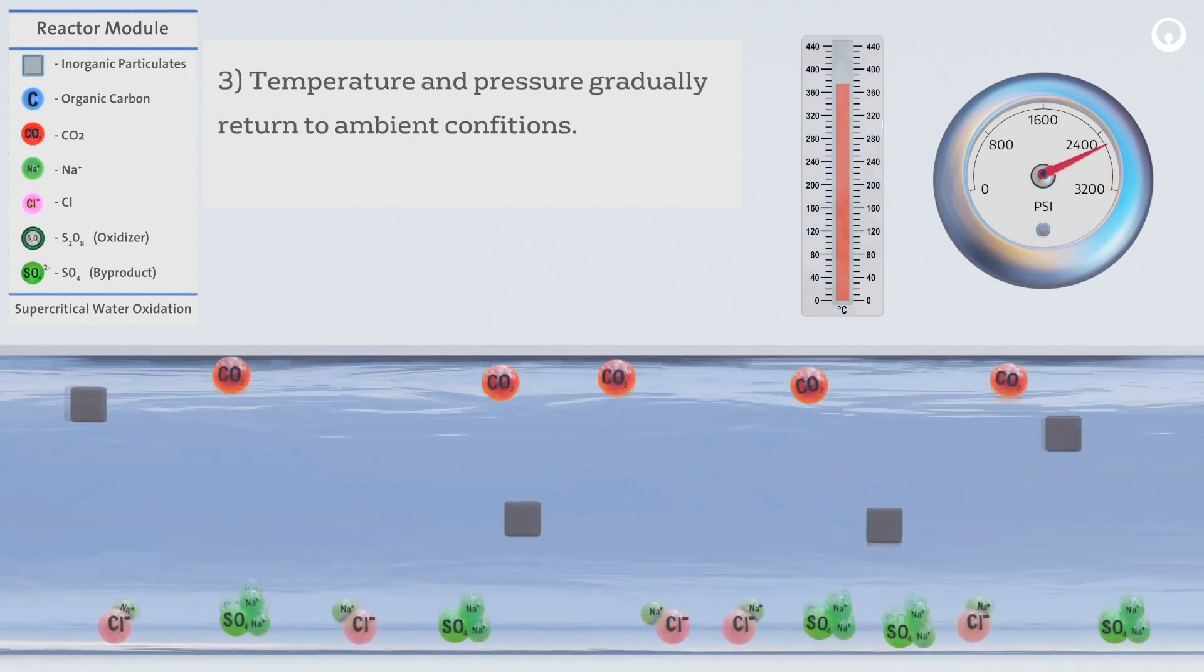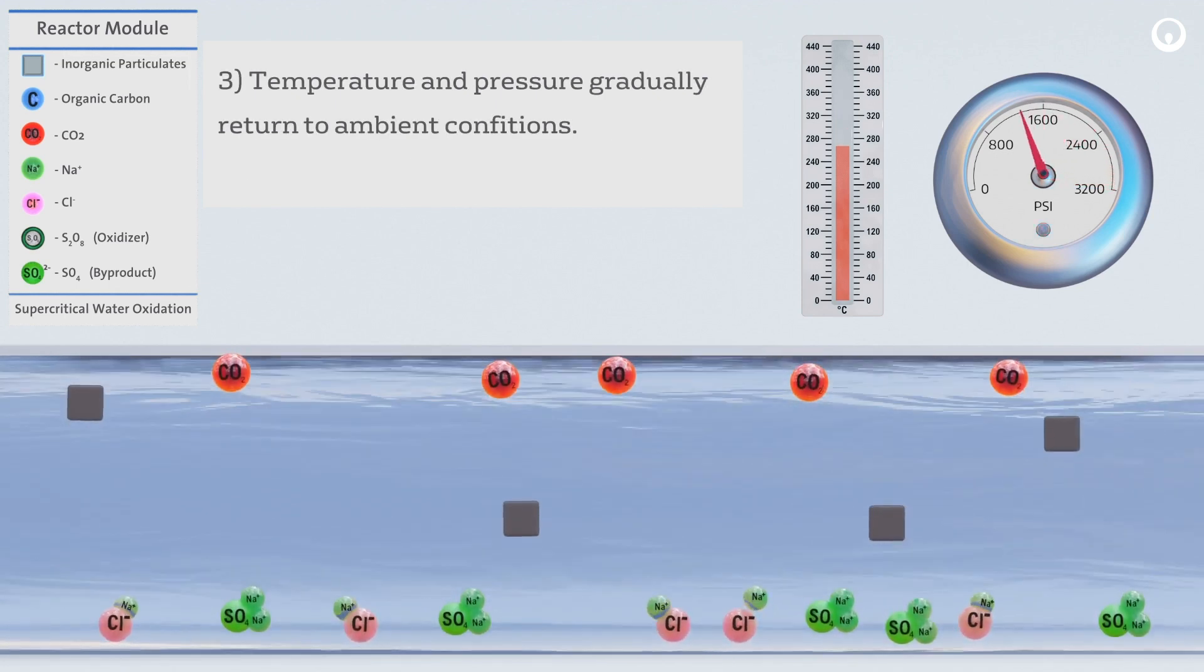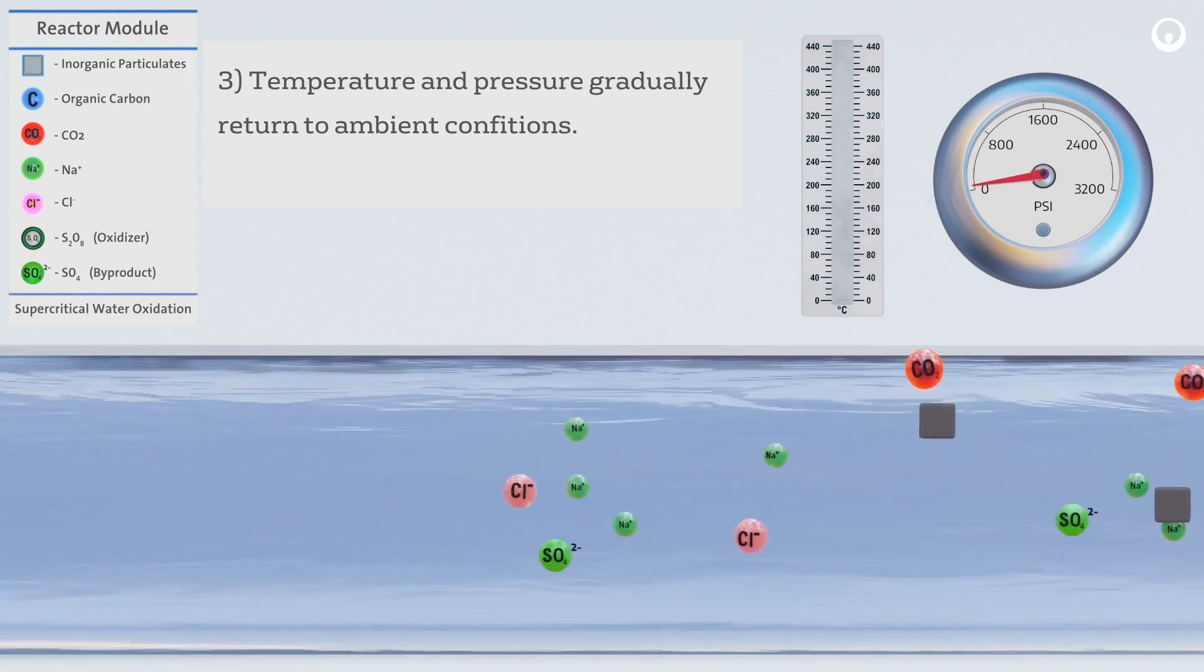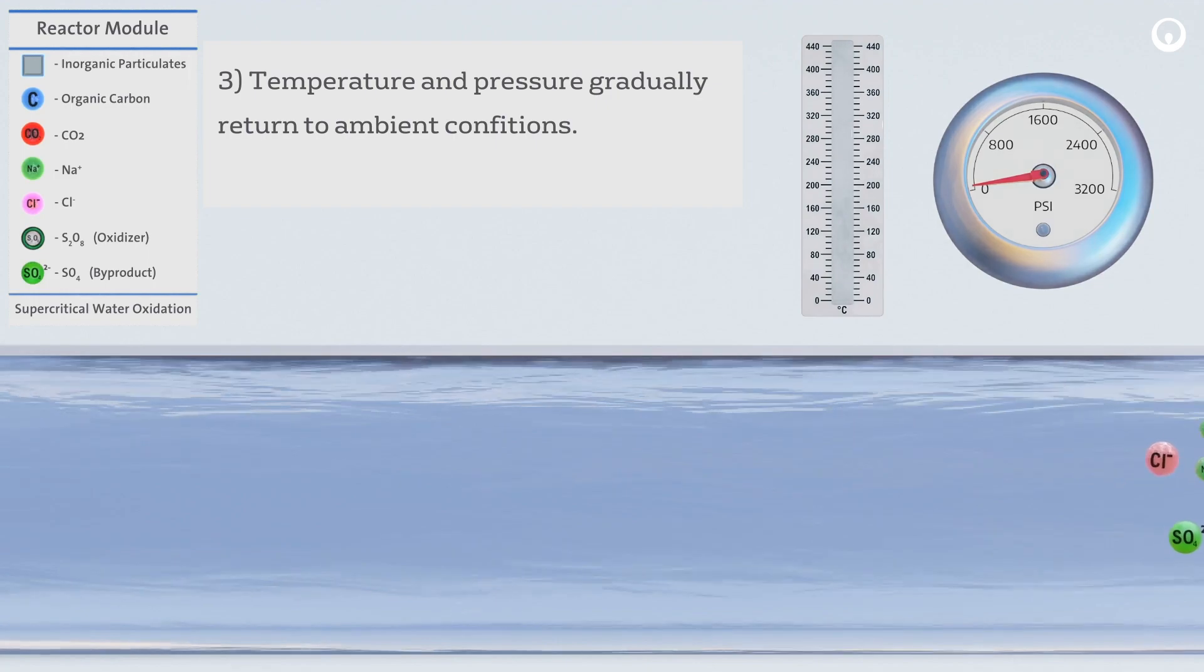Lastly, temperature and pressure gradually return back to ambient conditions. Salts dissolve again in the water and are flushed out of the reactor, along with any remaining particulates.